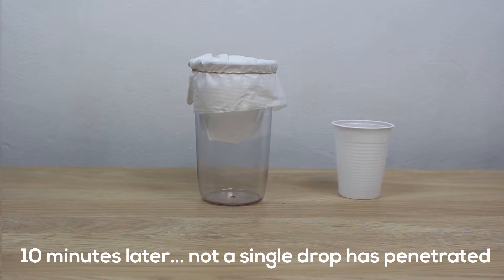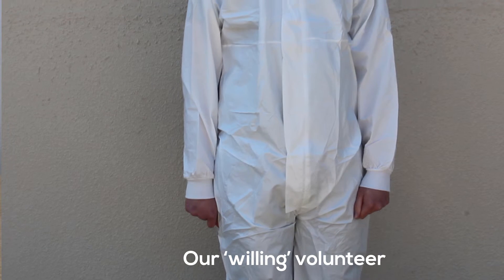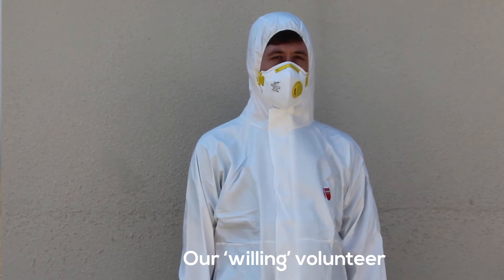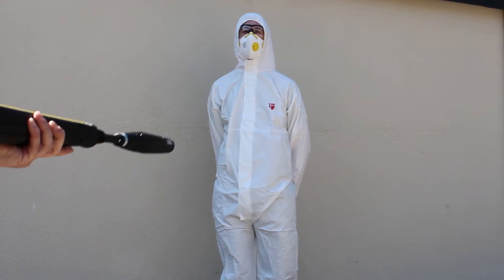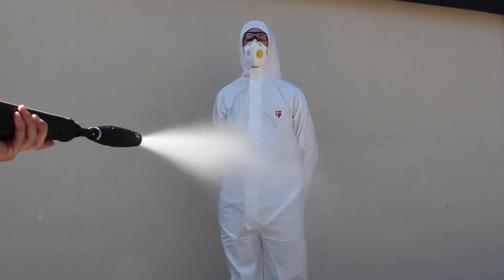Very effective, I'm sure you'll agree. So how did our Optimum Type 5 and 6 garment stand up to a much more extreme test? Here is our willing volunteer — please don't try this at home. Notice the high water pressure that our garment is exposed to.